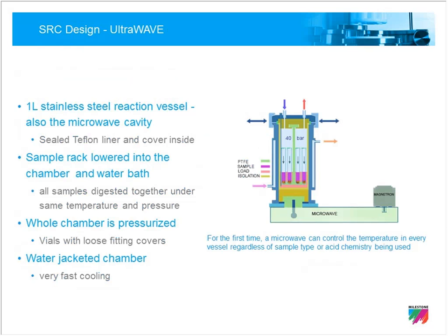So in terms of the design of the system, it's relatively basic. There's a 1-liter stainless steel reaction vessel, and it's within this reaction vessel that you're going to be doing your sample digestions. The sample rack is lowered inside of the chamber, and there are 2 key concepts with SRC.